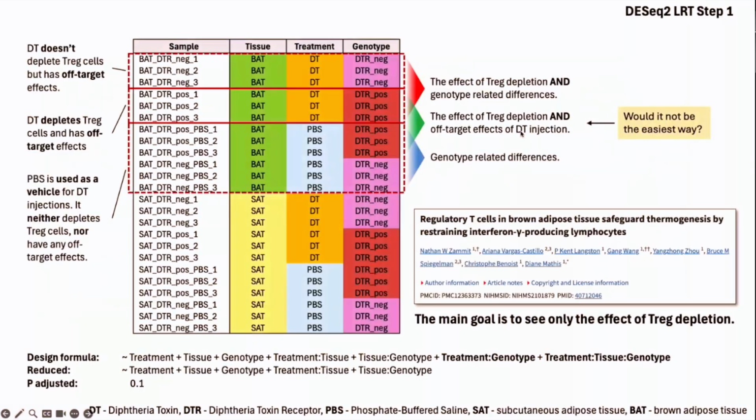And in order to explain it using a good example, I found a paper where they had a very complex RNA-Seq analysis, and I tried to reproduce at least part of this paper. The reason why I selected this paper is because they have several conditions by which they group the samples. So I will try to briefly explain, without much of the biological details, what we have here and how I ran this analysis. So they had 24 RNA-Seq samples.